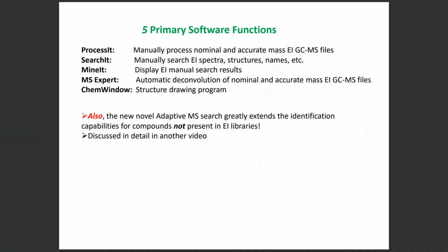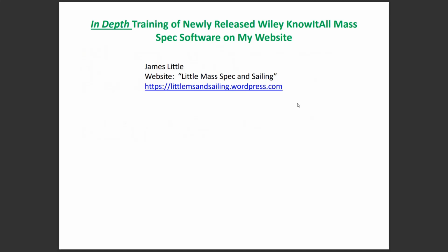Well, I hope you've enjoyed this overview of the 5 primary software functions of the new mass spec software from KnowItAll. However, if you need to know how to actually use it, please go see my in-depth training on my personal website.